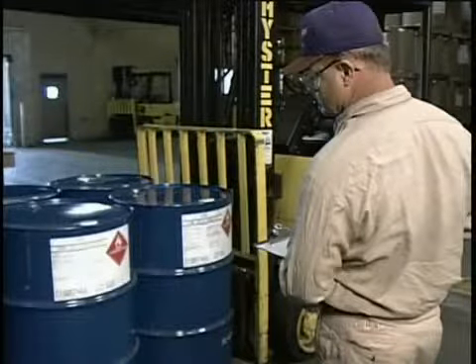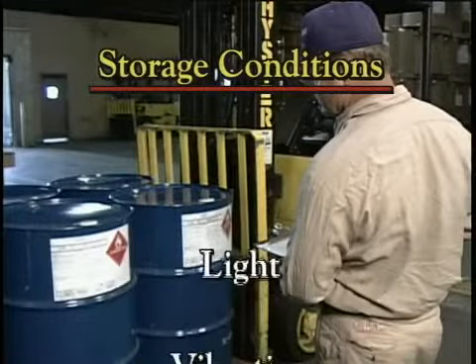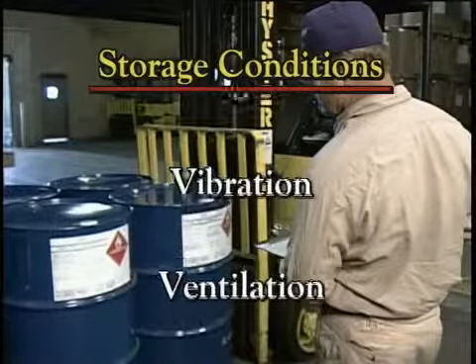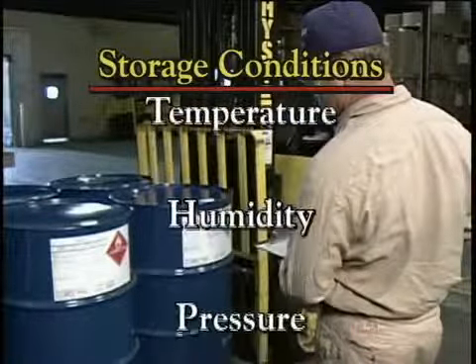Section 7 also describes the appropriate storage conditions for the material. Factors to consider when storing a hazardous chemical include exposure to light, vibration in the area, ventilation, temperature, humidity, and atmospheric pressure.